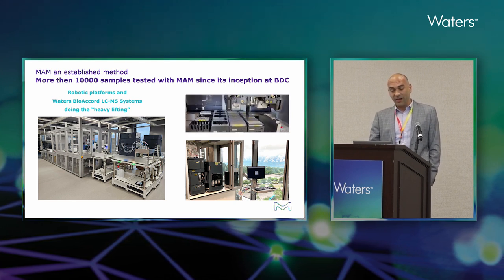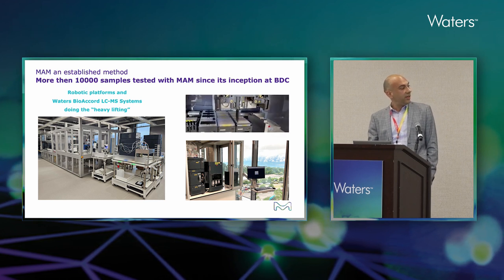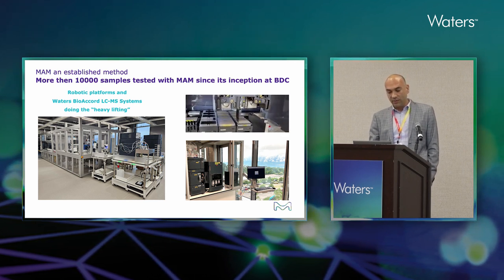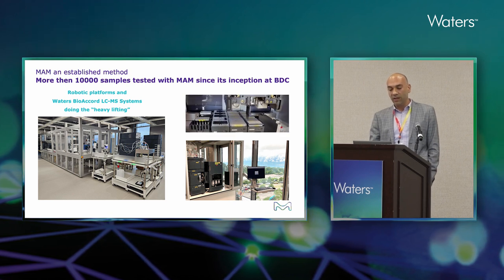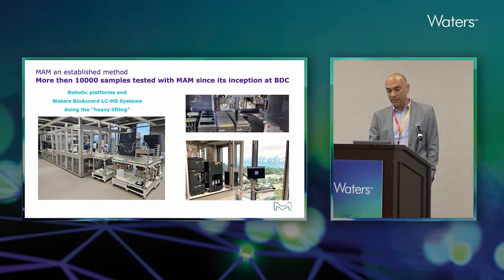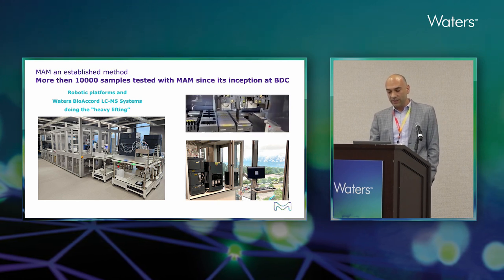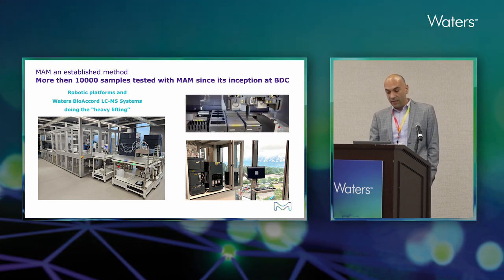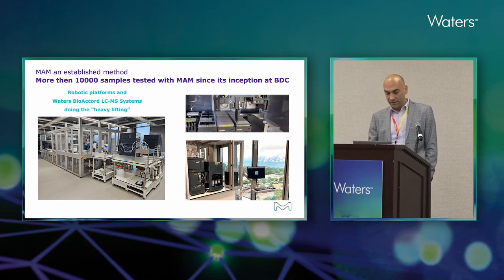Thankfully, the company heavily invested in automation. You see here on the left our custom-designed robotic platform that is capable of performing hands-off sample preparation and analytical chemistry. And on the right, the Waters BioAccord system that we selected as a platform to deploy mass spec in a regulated environment.